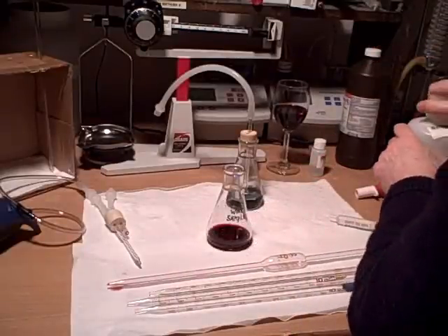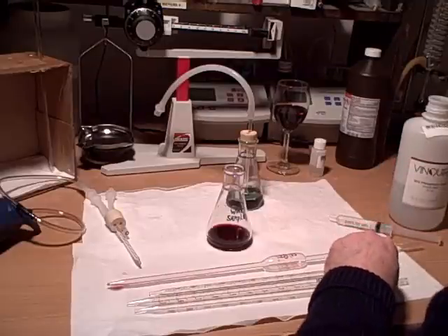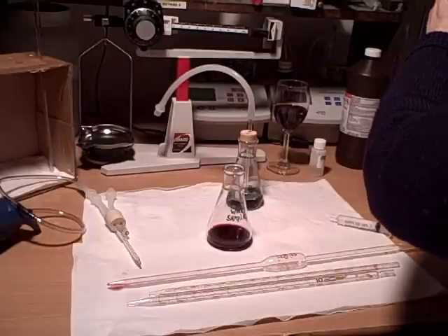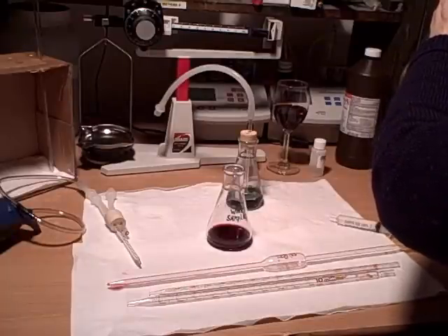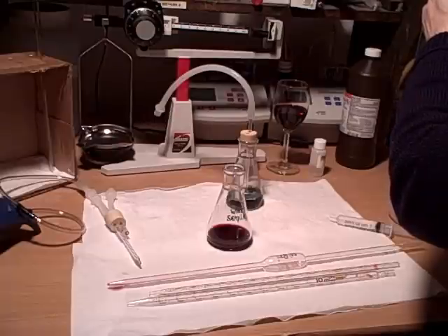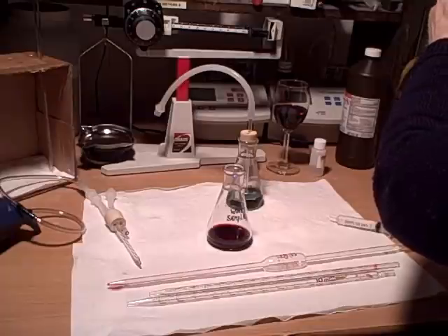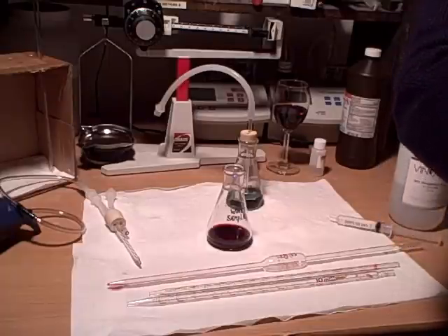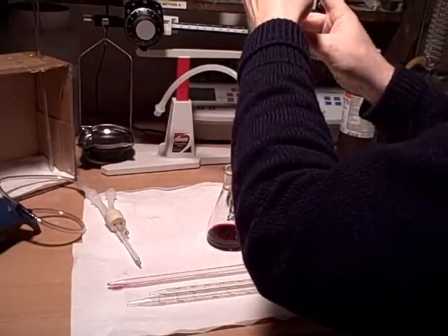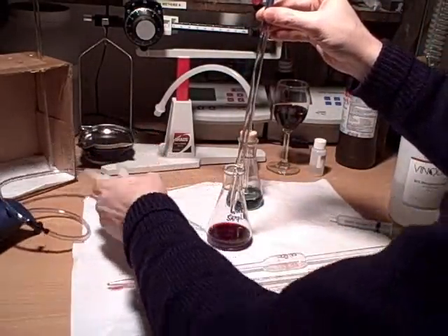So into that 20 mls of wine sample, we're going to be adding 10 mls of our phosphoric acid. One thing to be aware of is that as soon as we add our phosphoric acid into the wine sample, SO2 gas is going to start to be released.